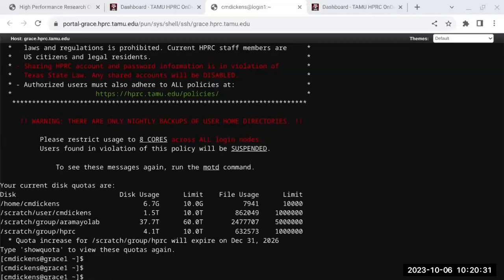So paired end is just an example of what you might see. A 400 base pair fragment, if you do 100 base pair read length. MiSeq does up to 300, but the large sequencers don't go to 300, so let's just say you have a 100 base pair read. Then you'll have a section in the middle that doesn't get sequenced, but you have enough coverage that when you're doing assemblies or alignments, you'll be able to determine that region because you have multiple DNA fragments.